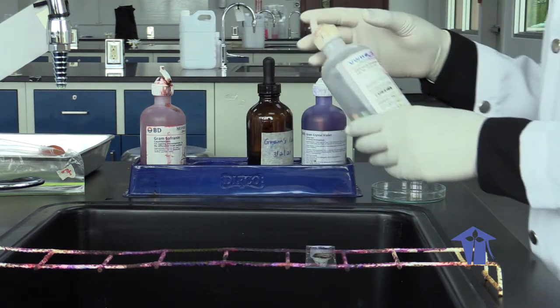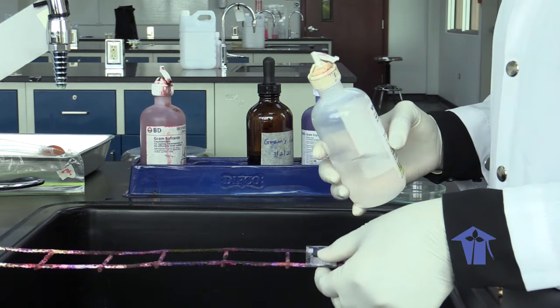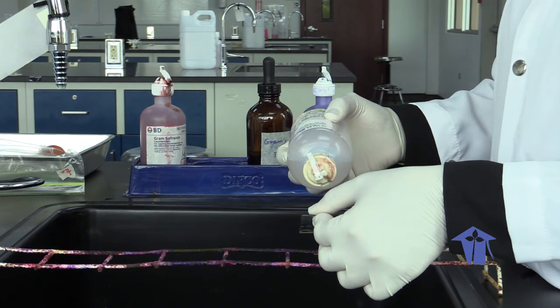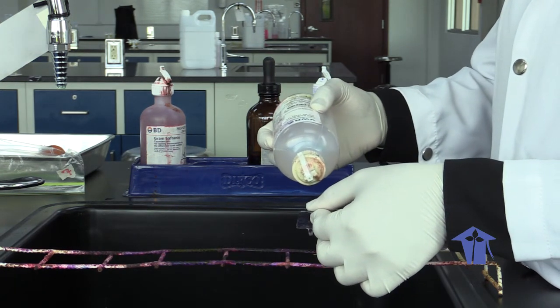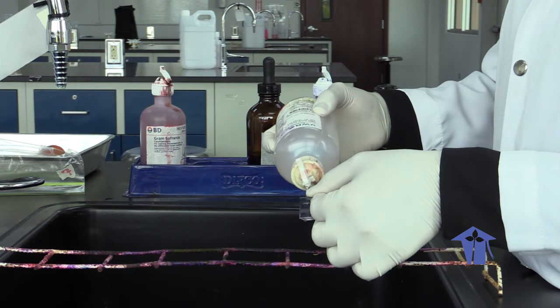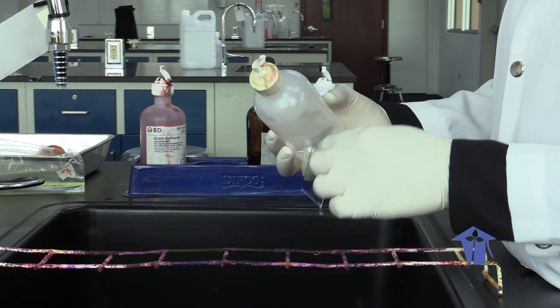After 1 minute, the next step is step 4, decolorize with alcohol. So we have our decolorizer here. We hold our slide again at a tilted angle and we apply decolorizer. It's recommended about 10 to 20 seconds until your solvent flows colorlessly. So depending on your sample, you will know how to manipulate that 10 to 20 second time. So I have a colorless flow there.